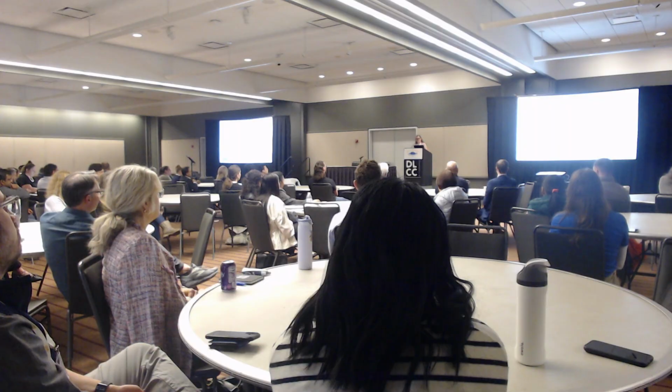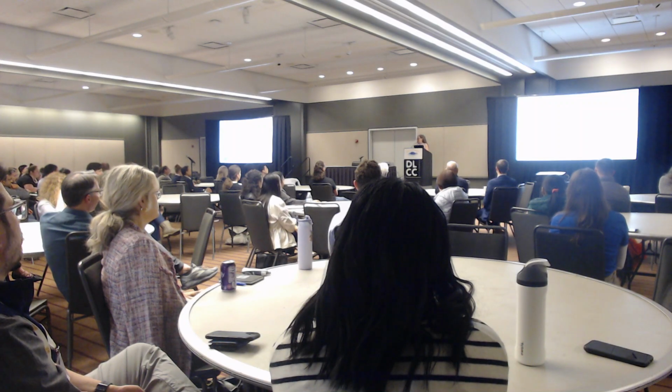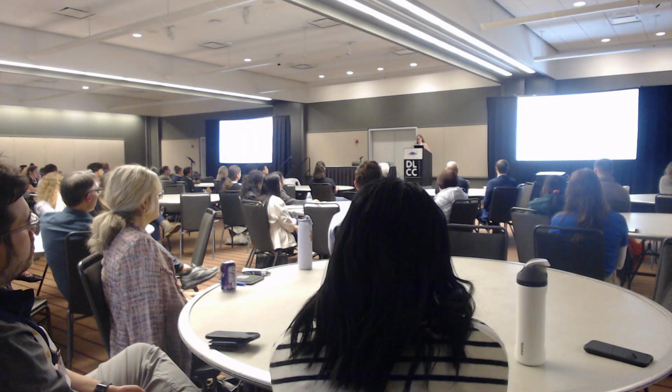So investigators were calling me and asking, I want to do 5-hmC. What do you offer? And I would say 5-hmC DIP. That's the only one I know that can run. They would hang up on me. That's not a good feeling for a core director. Clearly I was not able to serve them. And there were a couple of instances like that. It was not just one or two. It was like, no, I want single nucleotide resolution.